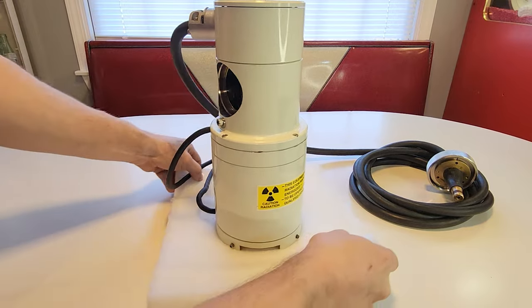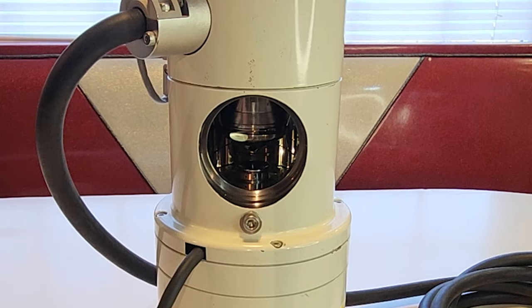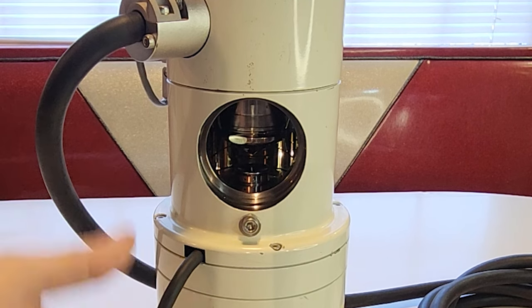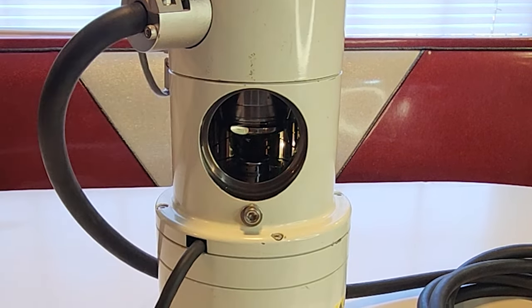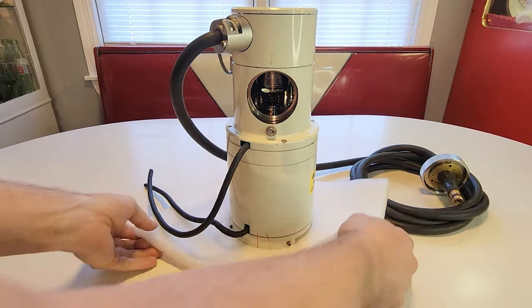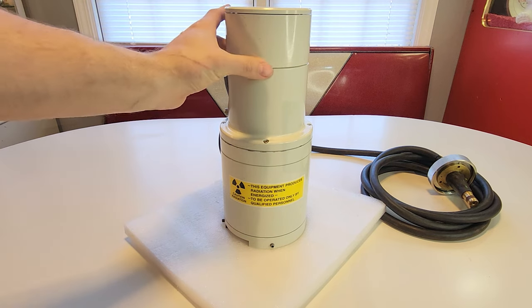We're going to rotate this around and get a glimpse at the amazingness inside. You can see the beautiful polished stainless inside. This is the main vacuum port — it would have gone down to the vacuum system. There would have been a roughing pump to pull down the vacuum, then a turbo molecular pump to pull down even further. This one might have had an oil diffusion pump given its age. This is where the vacuum would have been pulled. And here's your high voltage input. This unit is about 50 pounds for this little thermos-looking thing.